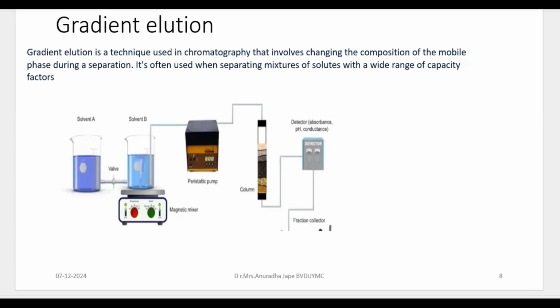The flow rate should be in between the maxima and minima. You have to adjust it to the one which will efficiently give you the best possible resolution in minimum time. As I said earlier, if time is reduced, fast elution will occur, but separation will not be good, and vice versa. So you have to optimize the flow rate, which will give you efficient resolution, and the time required is also as little as possible.